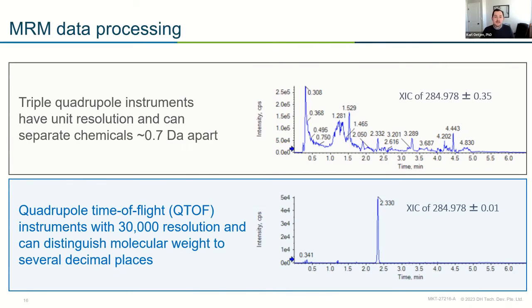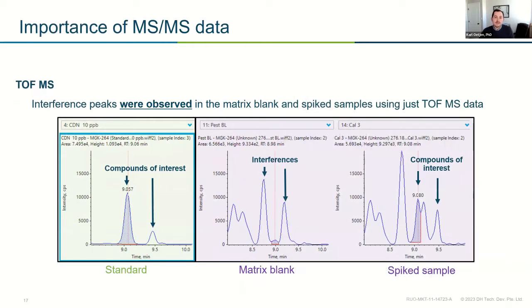There's plenty of trees, and we can kind of see what we're looking at. But when we use accurate mass, it's like going into the forest and looking at a specific tree of interest. So really zooming into our data. But that's just our QTOF MS or parent mass.